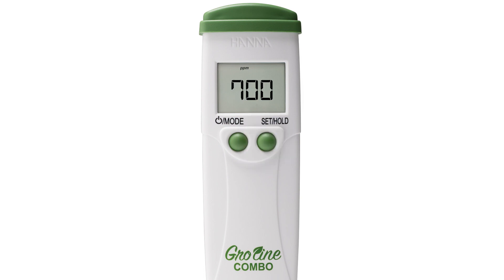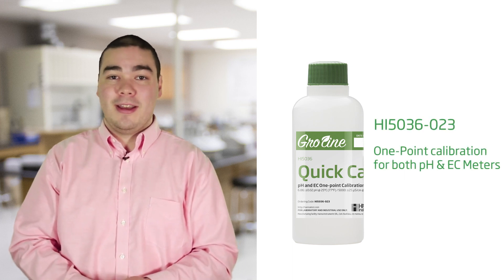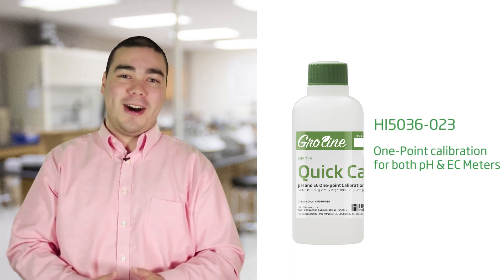Once you have chosen your preferred unit of measurement, press the mode button to choose your calibration type. By pressing the set hold button you can choose between CAL standard and CAL QUIC. CAL QUIC allows you to use our GroLine quick calibration solution, which provides a one-point calibration in both pH and EC — it's like having two solutions in one bottle.